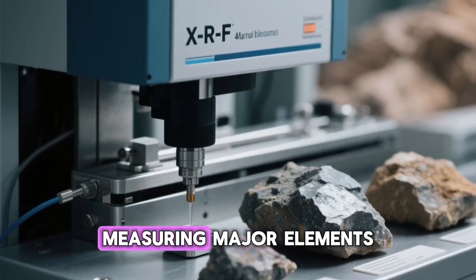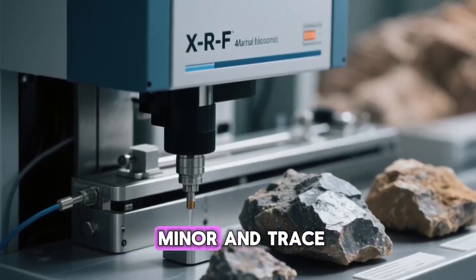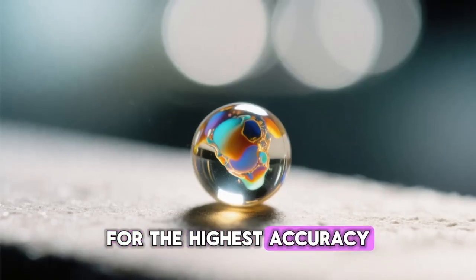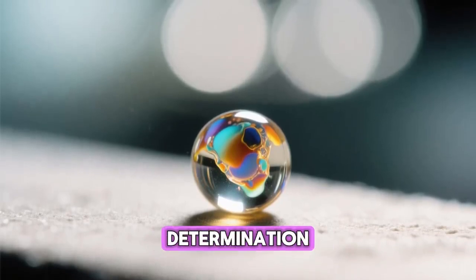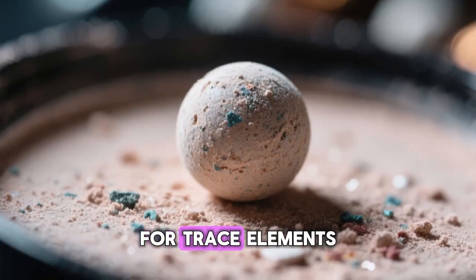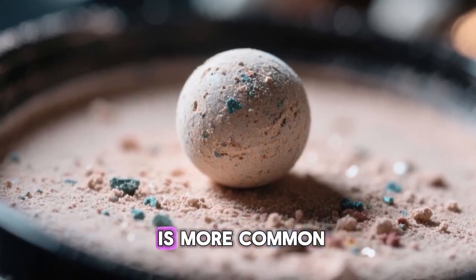XRF is used for measuring major elements as well as many minor and trace elements in geological materials. For the highest accuracy in major element determination, the sample is often fused into a small glass bead. For trace elements, a pressed powder pellet is more common.